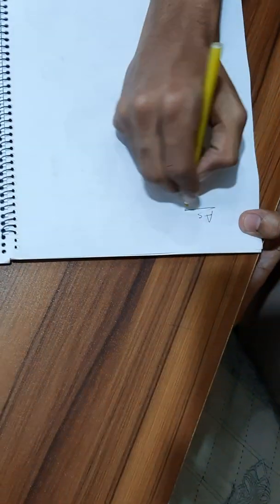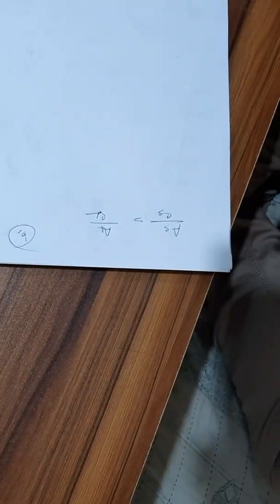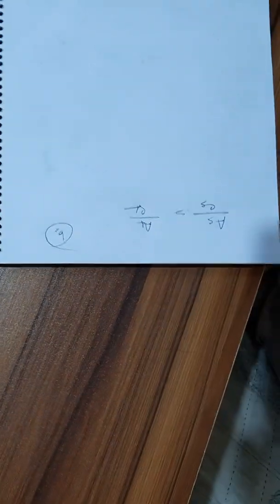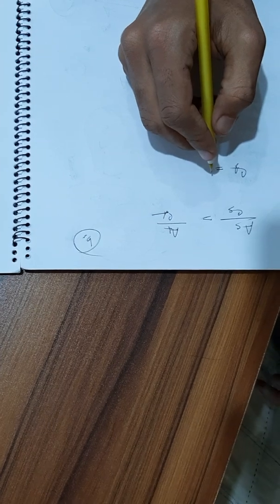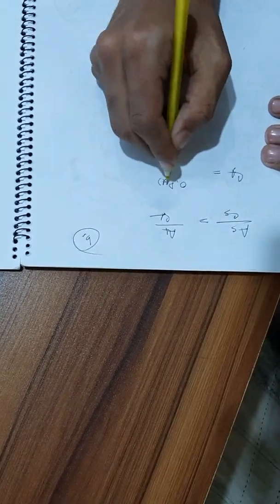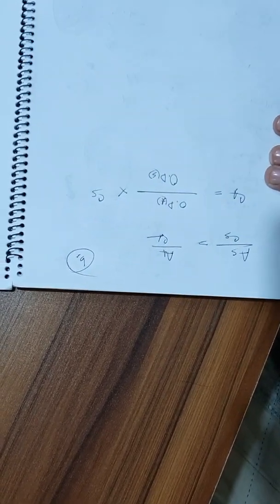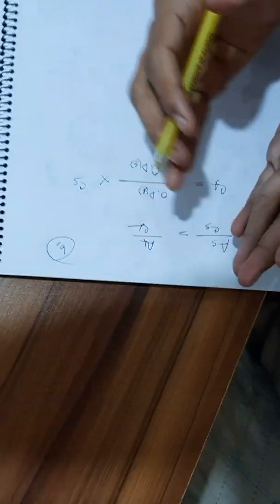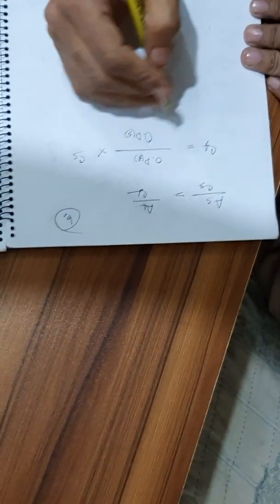As the thickness, or the length of the light pathway B, remains the same, we can say concentration of the test or sample equals optical density of the test divided by optical density of the standard into concentration of the standard, or concentration of the test equals absorbance of the test by absorbance of the standard into concentration of the standard.